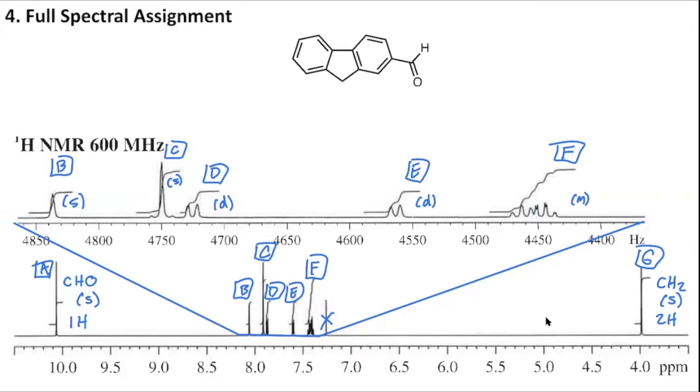All right, so we have some peak shape, and that'll tell us some information about potentially neighbors and number of neighbors. But the other thing is, how many hydrogens do they correspond to? Since we don't have the same scale for the top and bottom spectra, we can't get out a ruler and measure the integrals, which is how they did it back in the day and how some people still do it today. What we can do instead is use more of our straight edge tools and techniques, from iPad software, Google Slides, or PowerPoint, to our advantage.